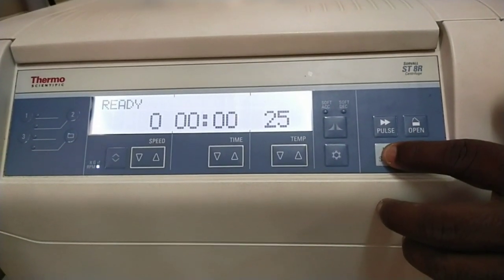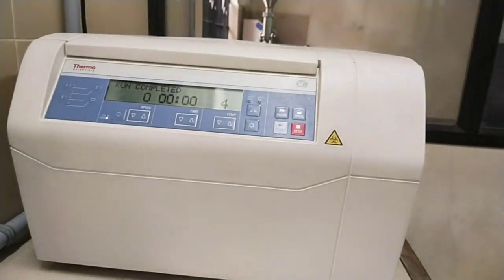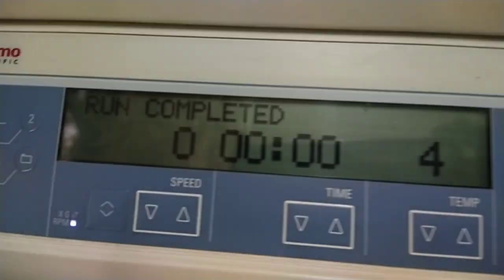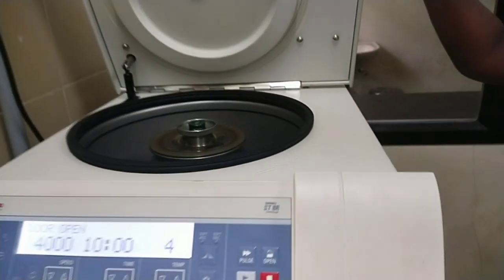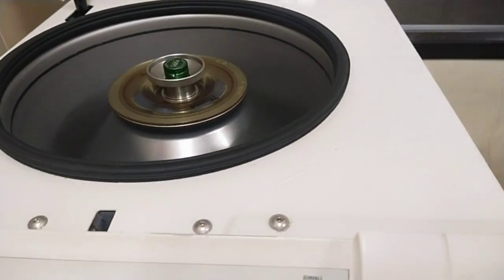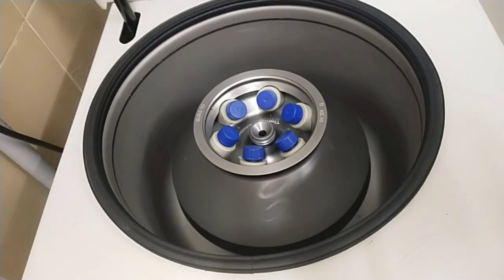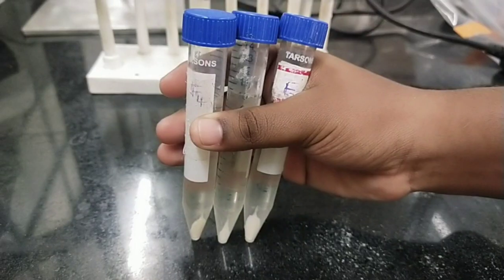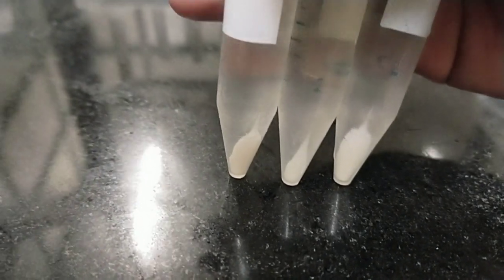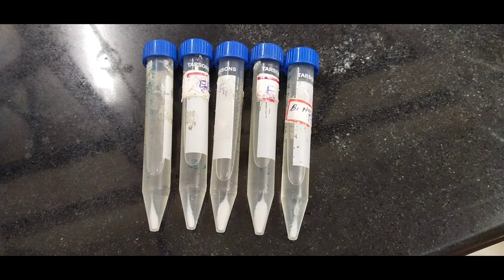Now press the start key on the control panel. Once the centrifugation run is completed, it gives a beep sound showing run completed. Now open the lid and remove the microtubes. You can observe how the solid is separated from the liquid mixture. The centrifuge spins the sample at high speed, and the centrifugal force causes denser material to travel to the bottom of the centrifuge tube rapidly. You can observe the precipitate at the bottom of the microtubes.